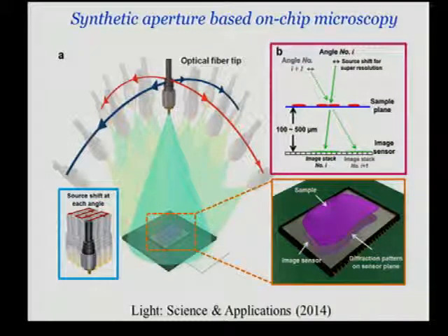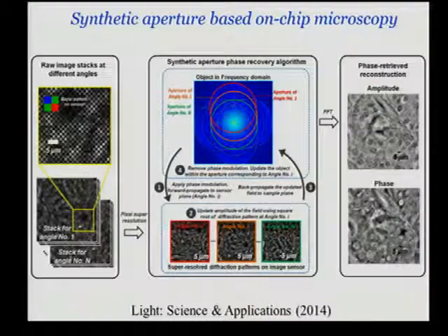This angular diversity, combined with pixel super resolution, gives you a frame to about double the numerical aperture of this system, which ultimately is limited by the refractive index of the medium. A lot of times we use some oil between the sample and the sensor to even enhance that. And this kind of a platform gives us stability in phase reconstruction. We have redundancy in the frequency map because different angles give you some overlaps.